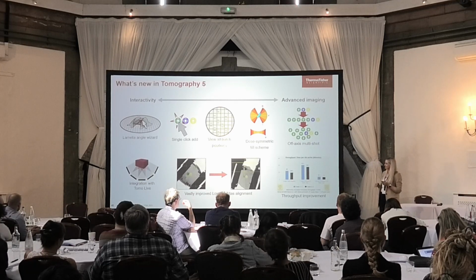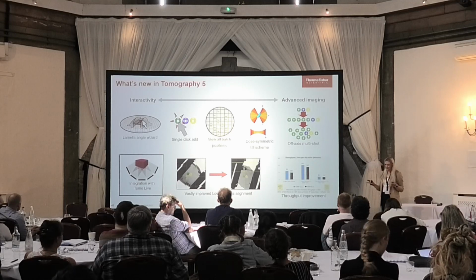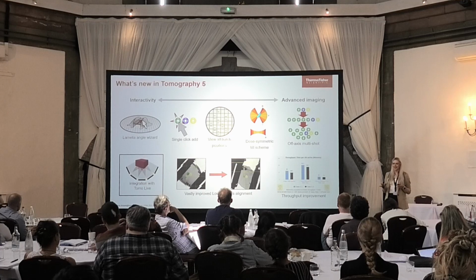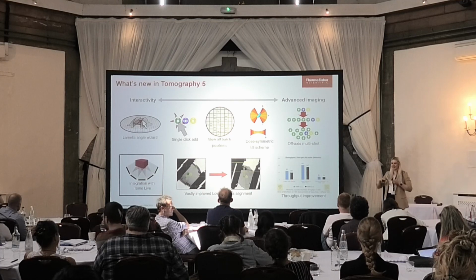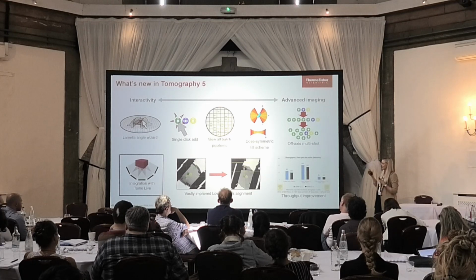Of course, we also think it is really important to have some way to see whether these tomograms are any good, in a way that's a bit more automated than somebody reconstructing them by hand. So we built and now launched the software called TomoLive.